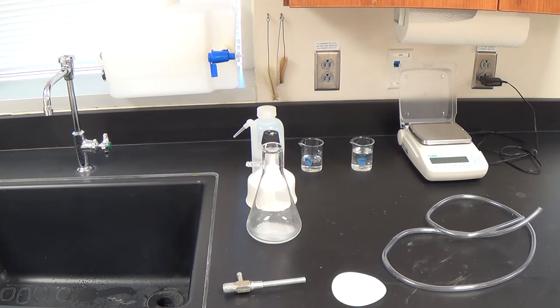I want you to determine how hard the tap water is using gravimetric analysis. Gravimetric, like gravity, is talking about weight. Now technically it should be mass. We'll use our balance, our electronic scale, to determine the mass, but in chemistry, mass and weight, although they're not the same thing, we just don't care so much. In physics class, you better not get those two confused. That's a huge difference in physics class.